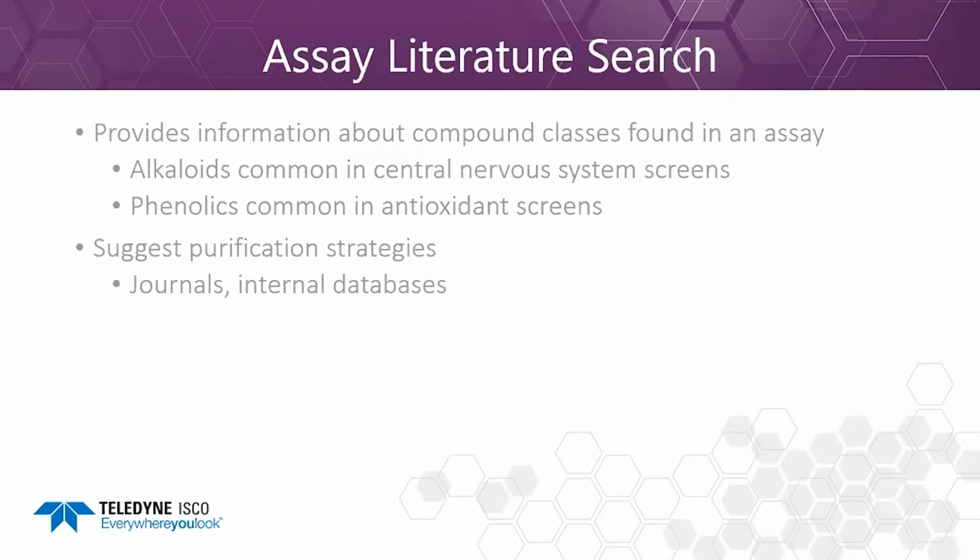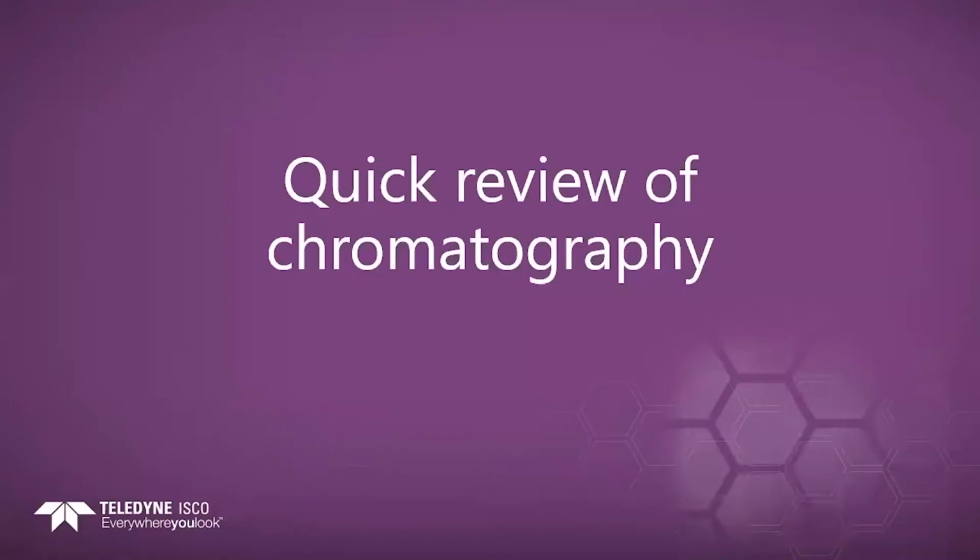So if you find that your compound might not be in a particular group, still test it and be sure. We'll have a quick review of chromatography for natural products, which will feed into extraction, and we'll tie it all together later.